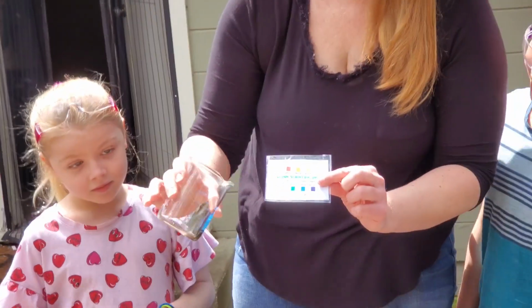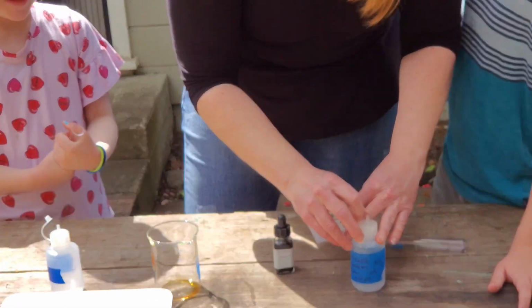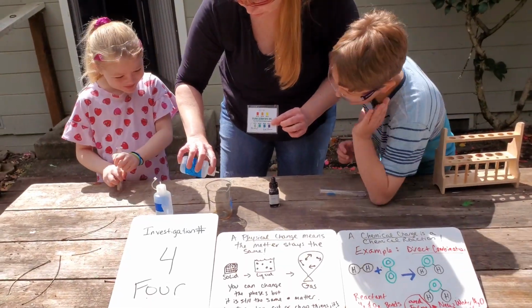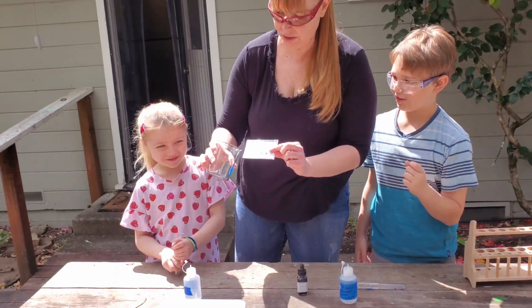Okay. Well, now it's too much. No, it's too much, Mama. Now I'm going to put more of the ammonia. Yeah, great job. Windex. I was kind of getting... Oh, let's just, there it is, right there.